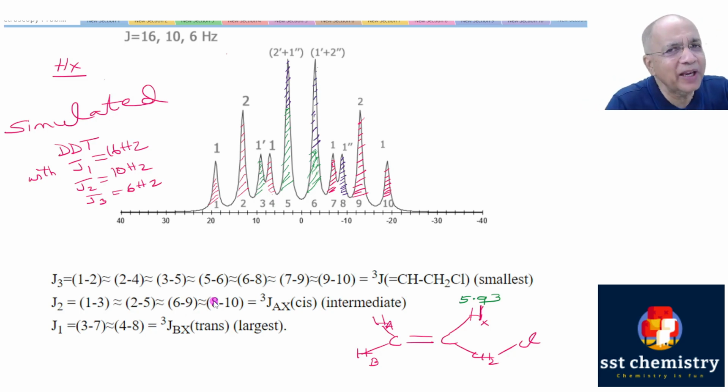Some other time I will explain how we can also find the J values by the reduction method. First, eliminate T by averaging all the triplets. Then eliminate D by averaging all the doublets. Then finally you are left with only D, and take that to get the highest J. This is called the reduction method developed by Professor Hans of Wisconsin University. I have equal fascination for using the reduction method wherever I find this peak separation method a bit difficult or a bit confusing.